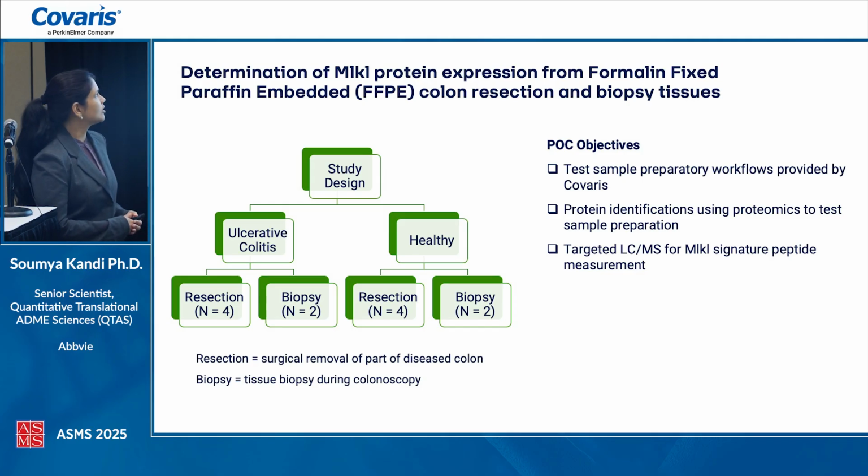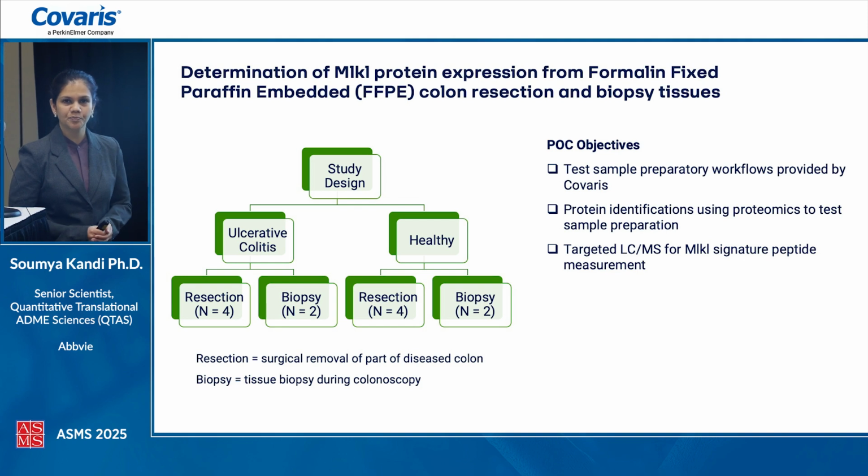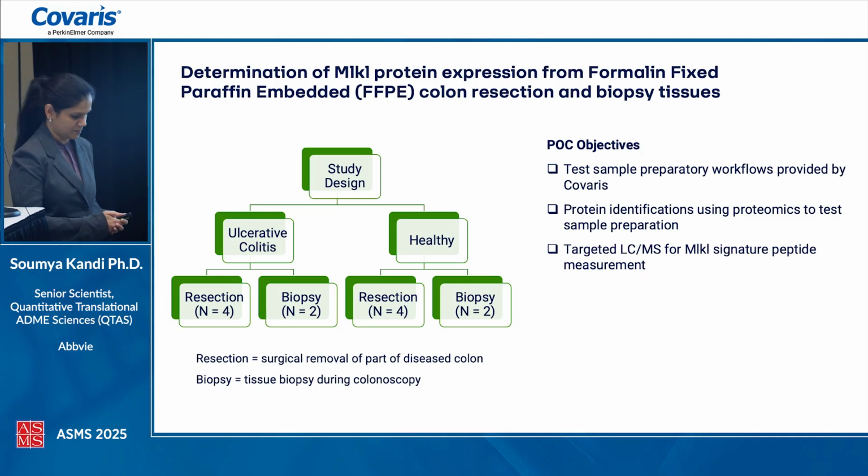We have colon tissues from ulcerative colitis donors as well as healthy donors. We have two kinds of FFPE tissues, tissue blocks: resection tissues and then biopsies. Now, the difference between resection and biopsy: resection tissues are surgically removed parts of colon. Biopsies are non-invasive or less invasive procedures that are performed during a colonoscopic examination.